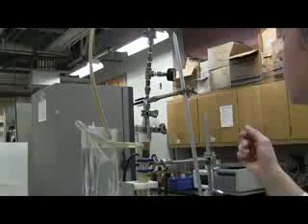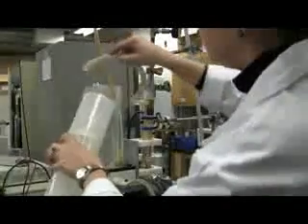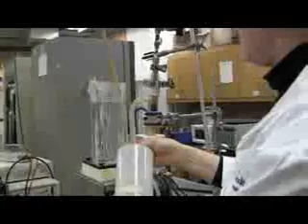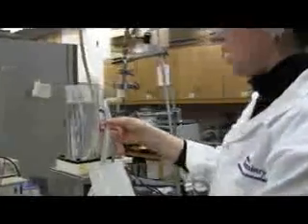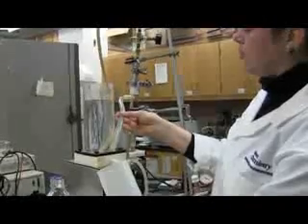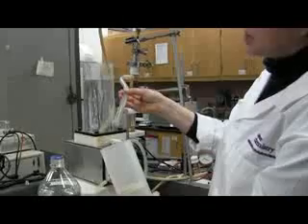Okay. So now I can show you that even with the valve all the way open, there is a drizzle of permeate flow. This is it. You see that? Now, how are you going to measure that flow rate?